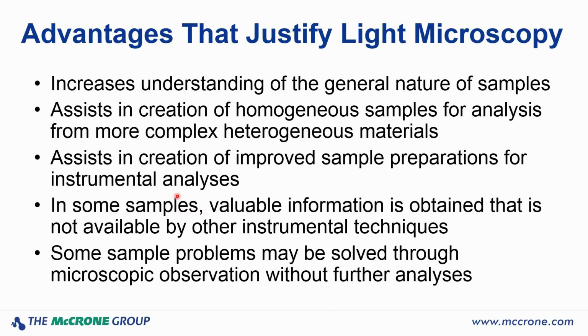And finally, some problems are just solved through microscopic observation. You don't have to do anything else. It's all you need, and you're done. It's very quick and easy, and you're out of it. And sometimes you spend hours going through instrumental analysis when a simple microscopic exam would solve your problem. So that's where I'm going to stop.